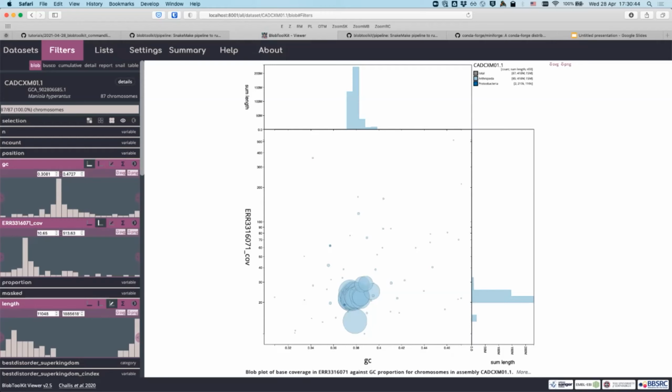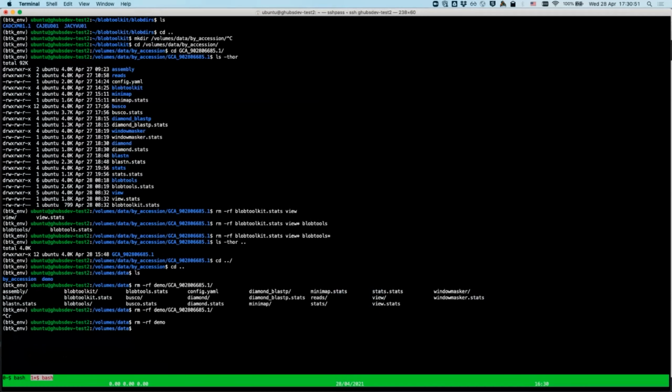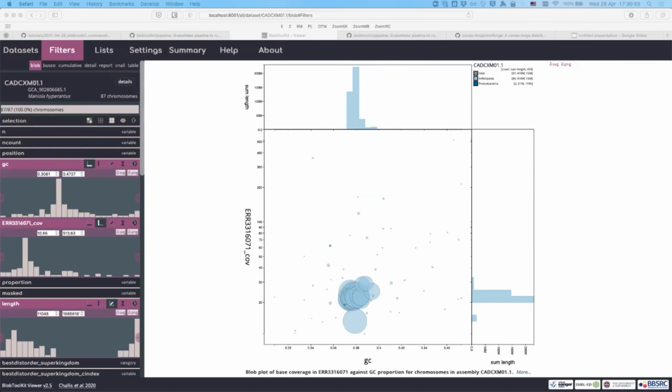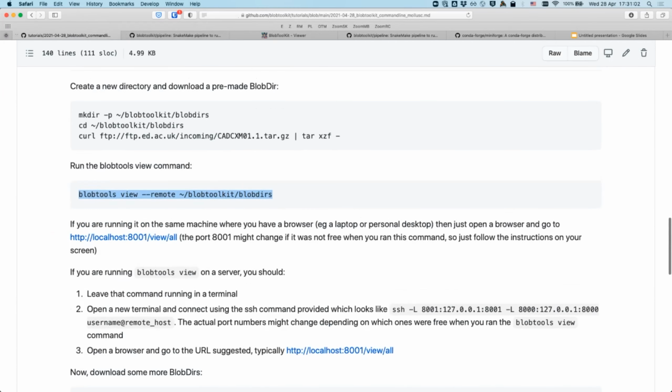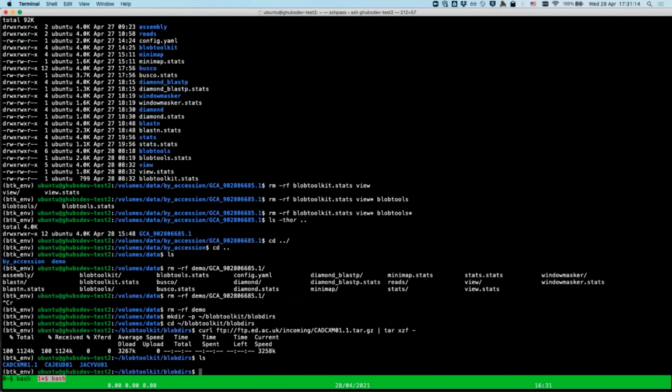Yeah. Good. I'll quickly show you how to do the cluster steps as well. So I am going to run exactly the same steps on a cluster. I will go to the tutorial, which is here, and I will run these 3 steps again on my cluster account. So that is here, make dir, download, it's downloaded. I actually had 2 others downloaded as well, but I'll just show you.